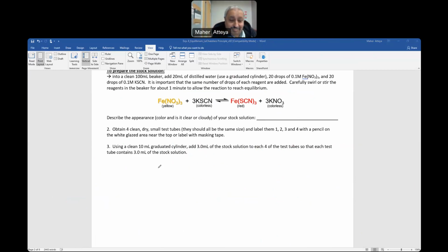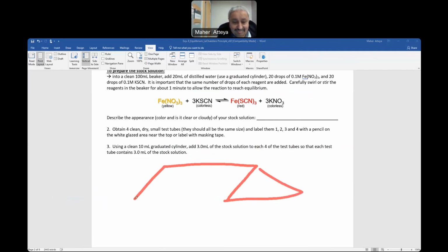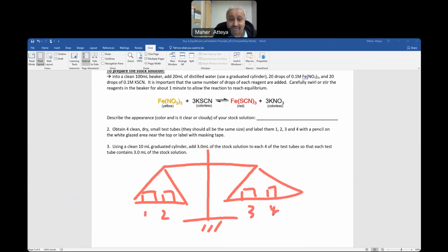Okay, so this is 1, 2, 3, 4. So 3 and 4 are the products. 1 and 2 are reactive. Okay. So now I'm adding another 2 here. Another 2. So we said this one will go down. This one will go up.